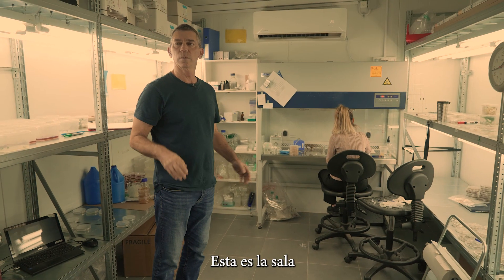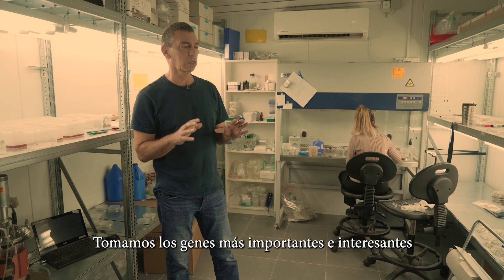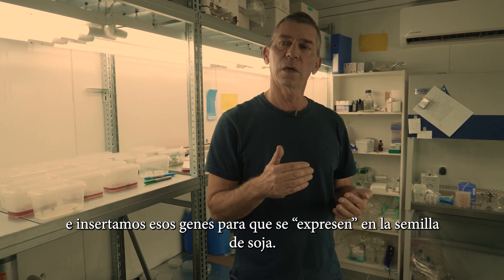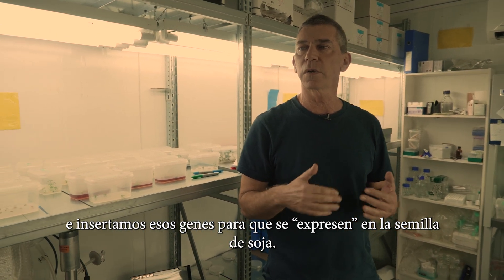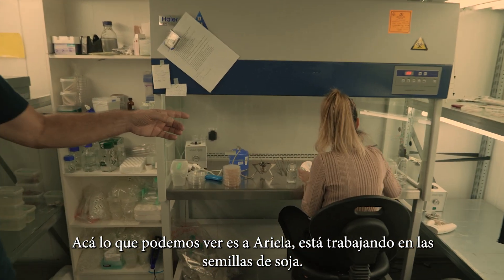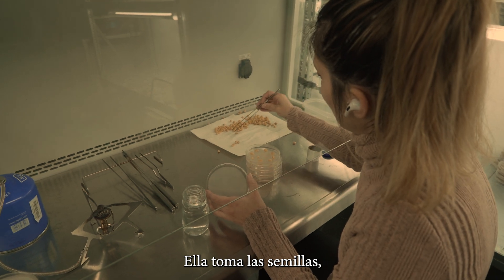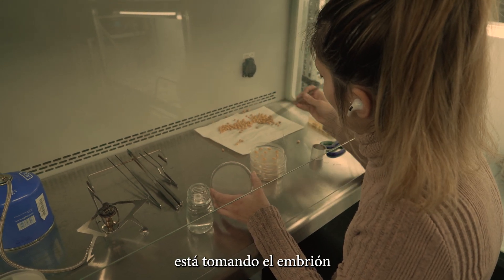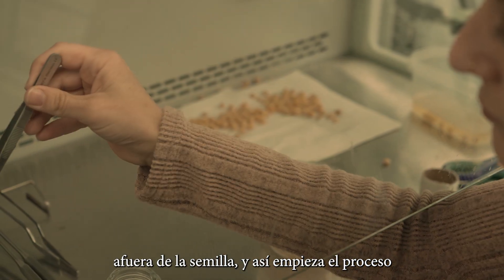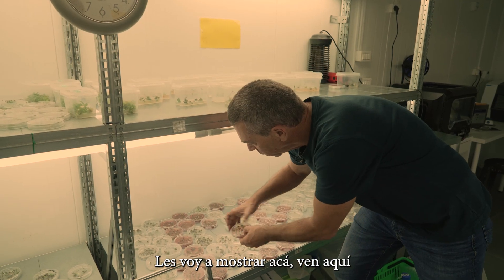This is the room where we're doing the tissue culture for the soybean. We're taking our most important, interesting genes and inserting them to be expressed in soybean. What you see here is Ayala working on soybean seeds — this is how it starts. She takes the seeds, takes eventually the embryo out of the seed, and will start a process that will transform the gene into the plants.